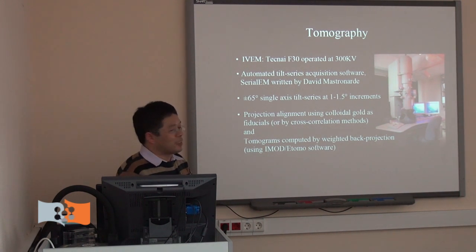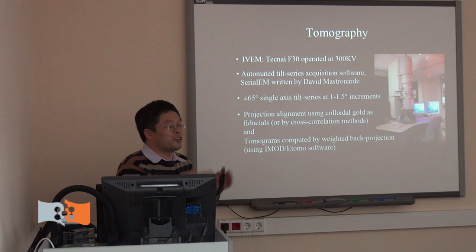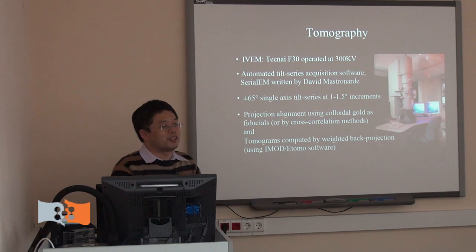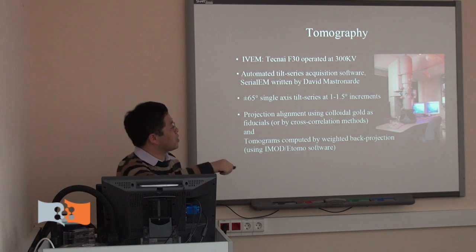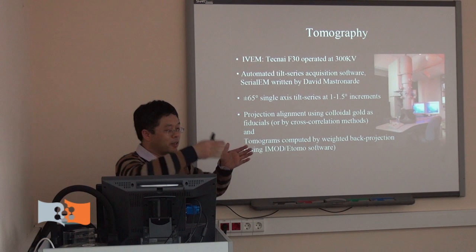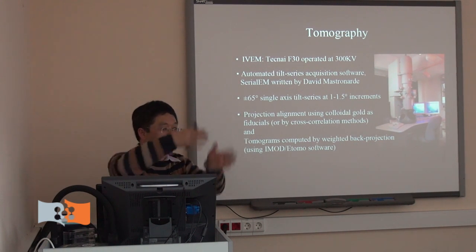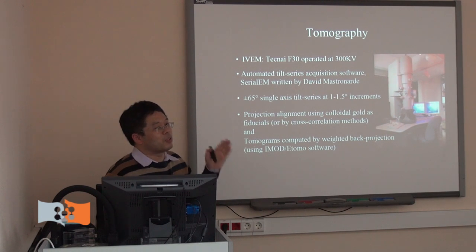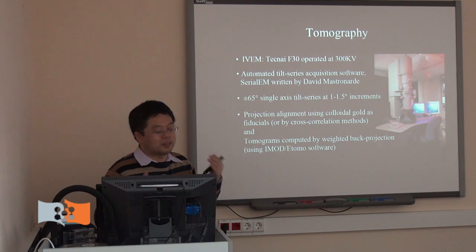For cryo-EM, it's very difficult because you cannot shoot a lot of pictures. You have to save the dose for your real imaging conditions. So we have to develop software to tilt, bring it back, and shoot a picture. So the principle of electron tomography was developed more than 30 years ago.